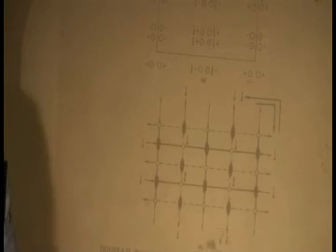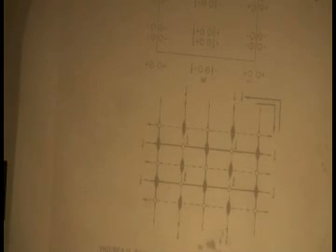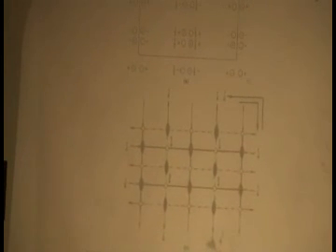Now it becomes important that we actually at some point talked about the international tables and what all these things in there mean. These are some pieces from space group IMMA. And this is the point where if you want to look at a Patterson map yourself, you need to know something about this. Here are the space group diagrams. They are useful if you want to figure out where atoms sit. But the really important part is this one, our table of positions.